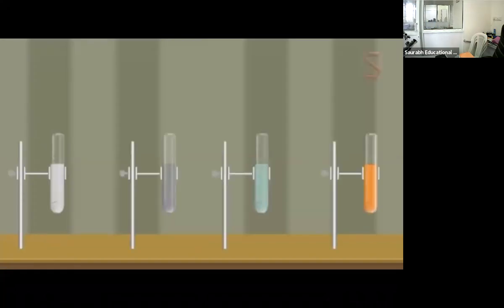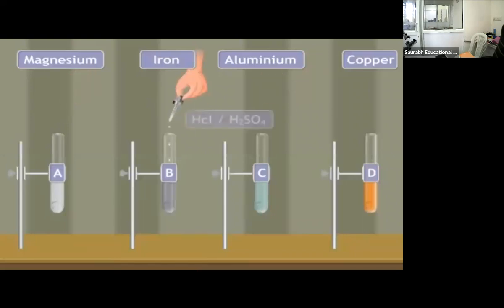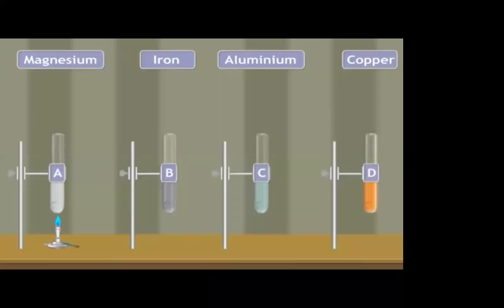Let's take four different metals, magnesium, iron, aluminium, and copper in four different test tubes A, B, C, and D respectively. To these test tubes, we add 5 milliliters of dilute hydrochloric acid or sulfuric acid using a dropper. We can now heat the test tubes gently using a Bunsen burner. Hydrogen gas is liberated. But how do we know it's hydrogen?